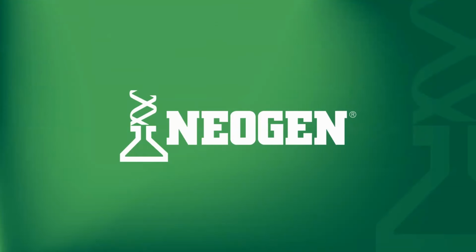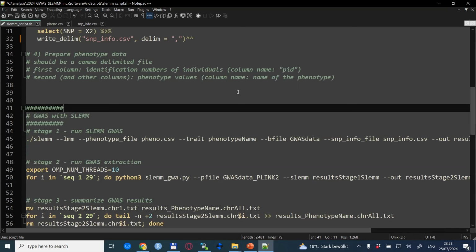So thanks again to Neogen for the support, and we are going back to the genome-wide association study with SLEMM. In the next few lines, we will actually perform the genome-wide association study with SLEMM, evaluate the results, and also then show how to visualize them.